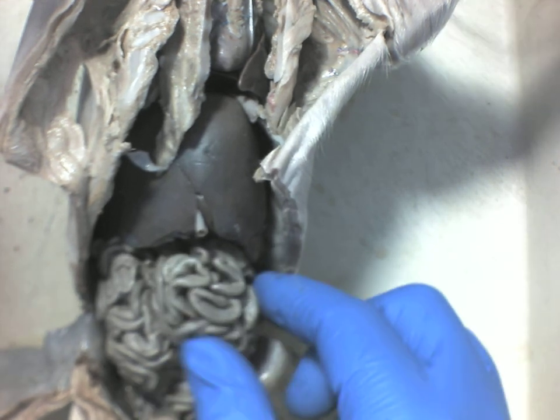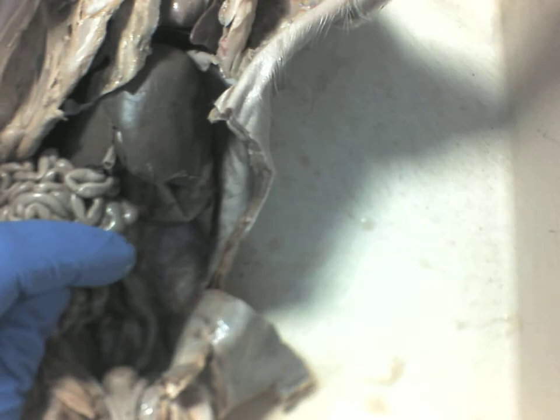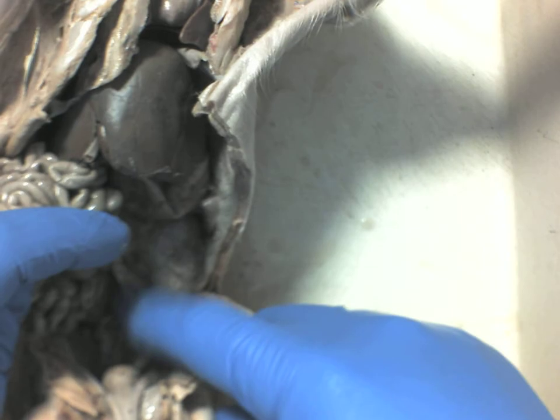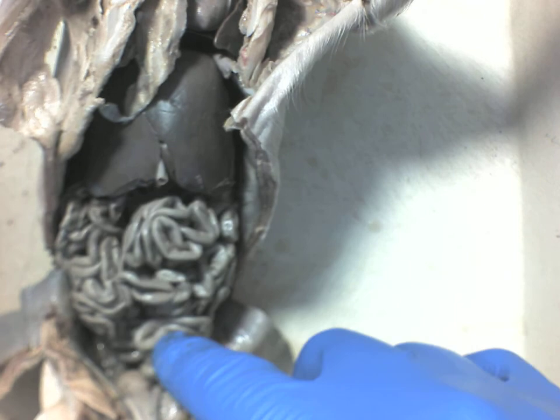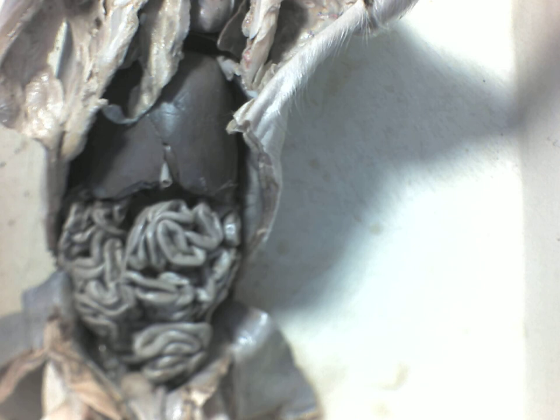Now, after it passes through the small intestine, which is really long, it'll then enter into the large intestine, which in most pictures you'll notice is kind of wrapped into everything. Typically it's located in the area right over here, where it's going to go directly into the anus. What is the job of the large intestine? It absorbs something. What does it absorb? Water, very good. The villi are in the small intestine.